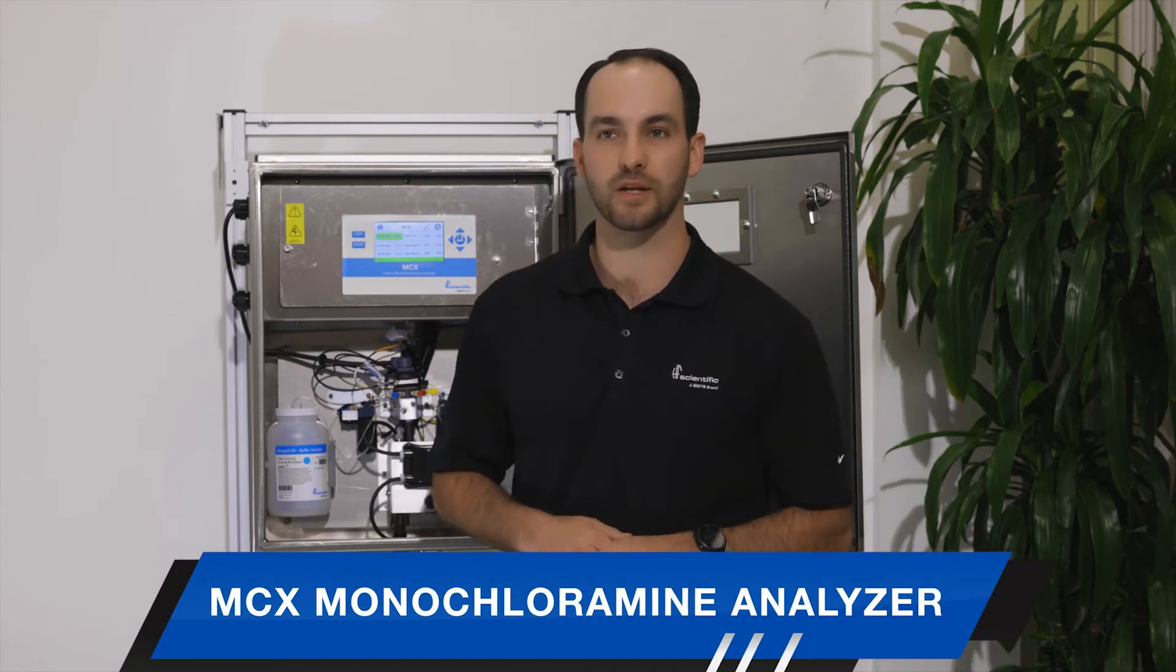Hi, I'm Eric Dibble, Regional Sales Manager at HF Scientific. Today, we will be going over how to do a reagent change on HF Scientific's MCX monochloramine analyzer.